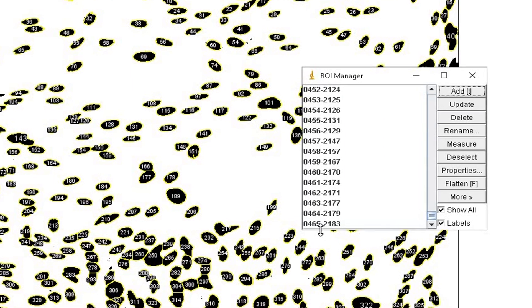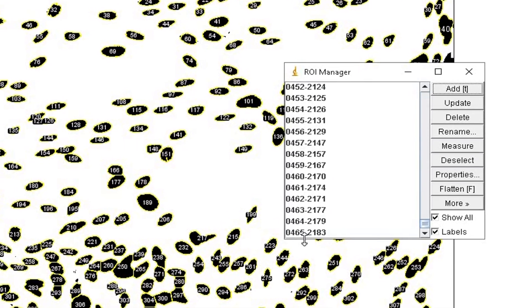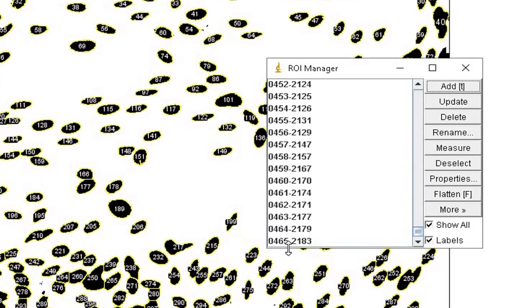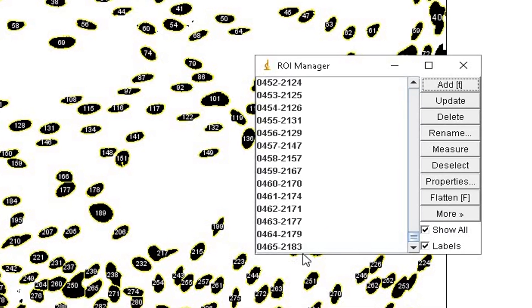Since our count shows 465 cells, therefore, the ROI manager will list the ROIs up to 465.